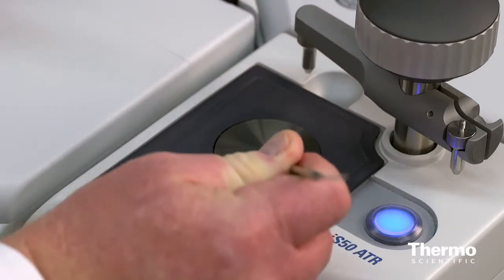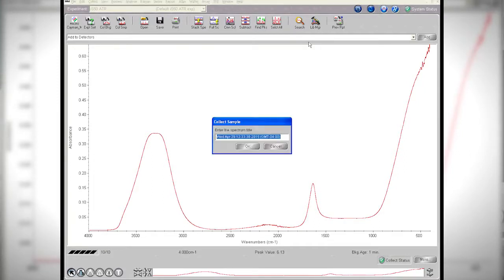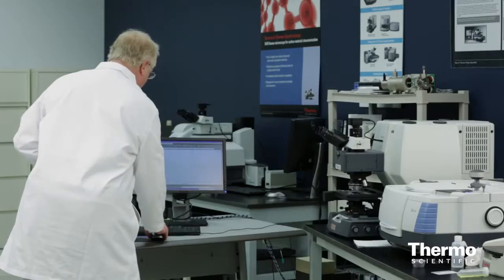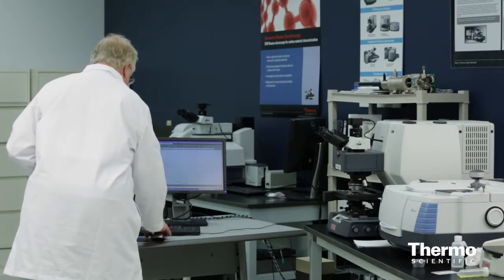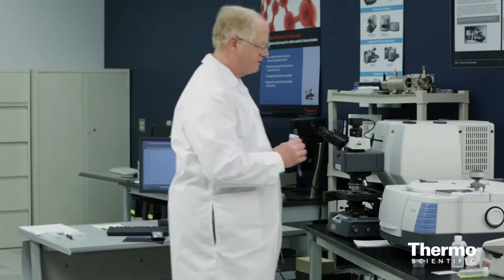And that is the spectrum due to the water. You can see there are really three bands present in it. This large absorption at the low frequency, this one right here, which is your bending mode of the molecule, and then we have the stretching of the molecule. So those are three different vibrations, very intense vibrations of water. So we'll keep that one. Let's look at the whole spectrum. Double click, Control F. So now we're looking at the entire spectrum.